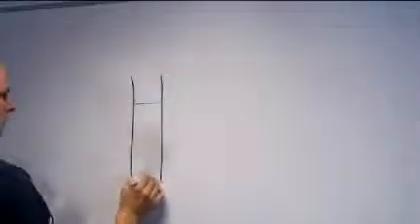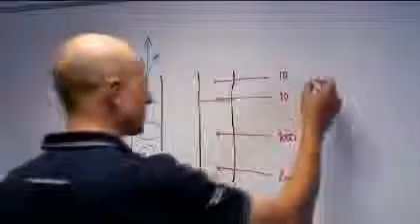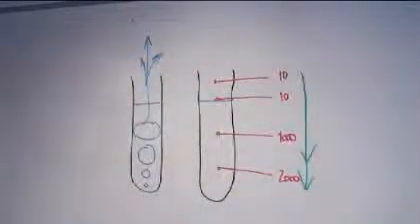The temperature of a boiling liquid cannot increase above its boiling point and is therefore very stable. With just a vacuum, bubbles would still develop in the sample whatever the set temperature. Bubbles in a tube will force liquid out. To prevent samples boiling over, a centrifuge is used to create a pressure gradient in the tube and ensure that the sample boils at the surface of the liquid.